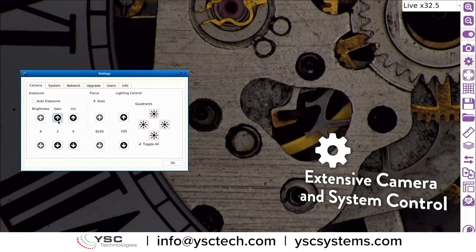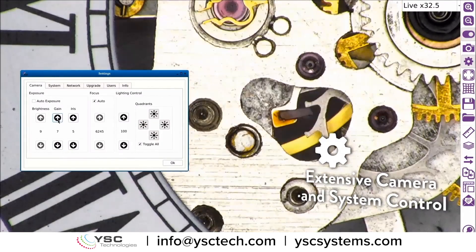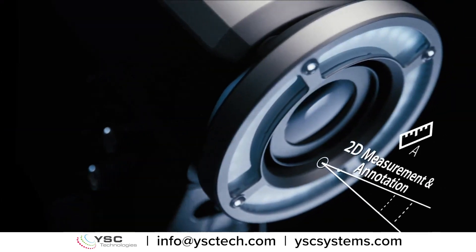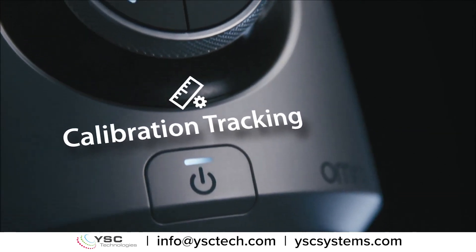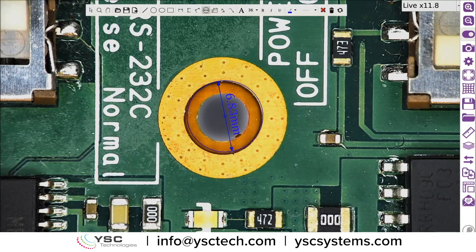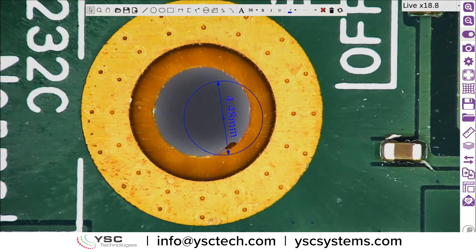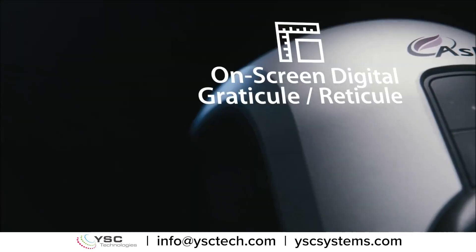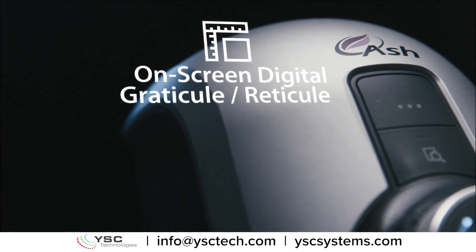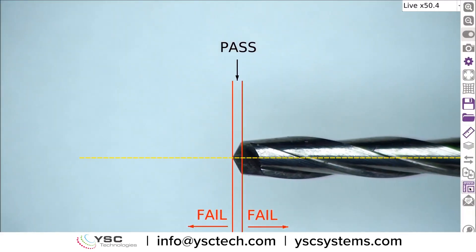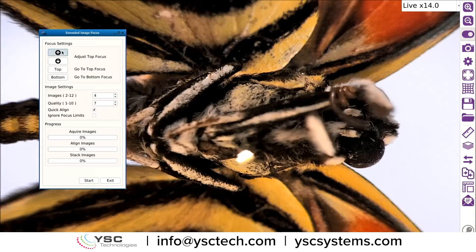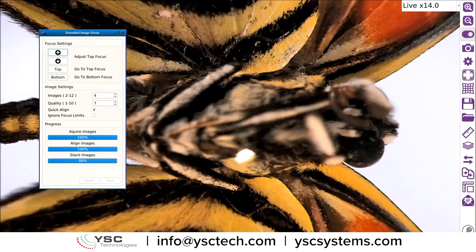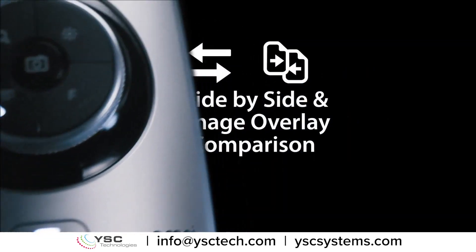Extensive camera and system control. 2D measurement and annotation. Calibration tracking. On-screen graticule. Focus stacking. Side-by-side image comparison.